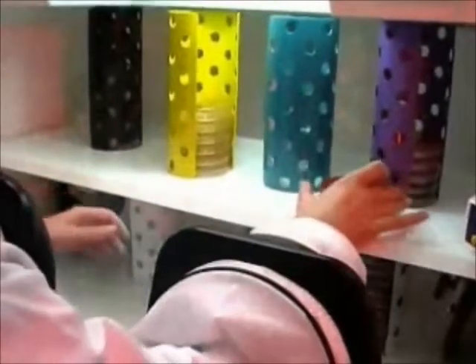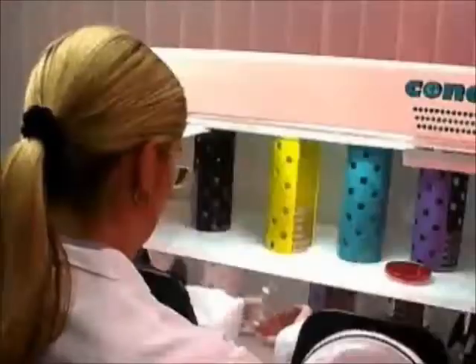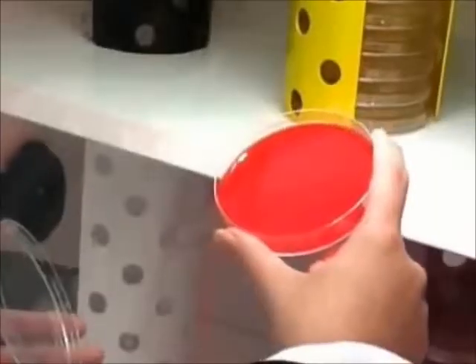All Ruskin workstations feature both a convenient pull-out shelf for easy access to stored samples, and a foot-operated halogen spot lamp for assistance with sample identification.